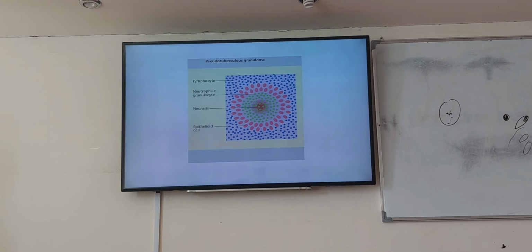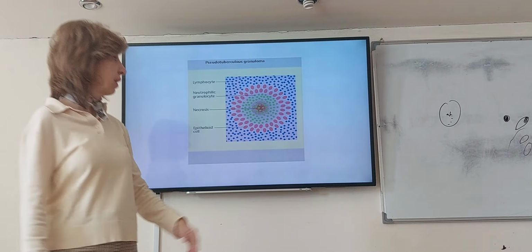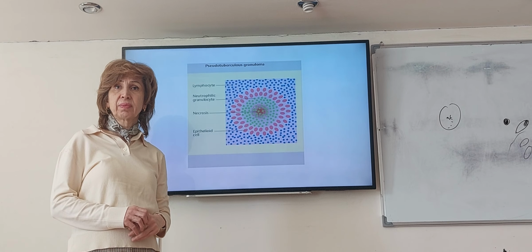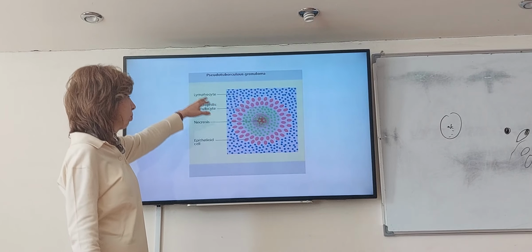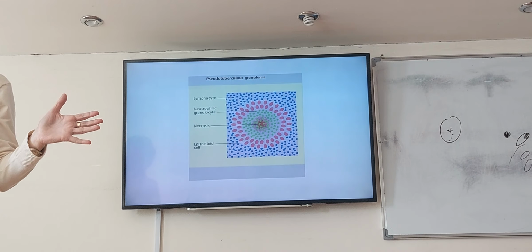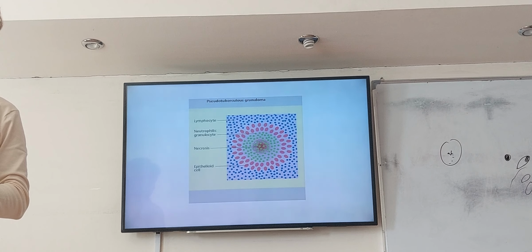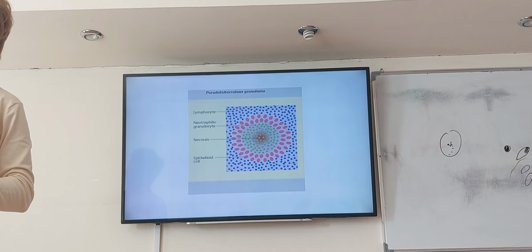Now, when I see pseudotuberculoid, what will you tell me? What do you see in the center? Necrosis. Neutrophils. Non-caseating granuloma is different; this is suppurative, pseudotuberculoid. It's a suppurative granuloma. Remember this word, because once you hear suppurative, it means neutrophils. And if you see any necrosis, it will be coagulative type.